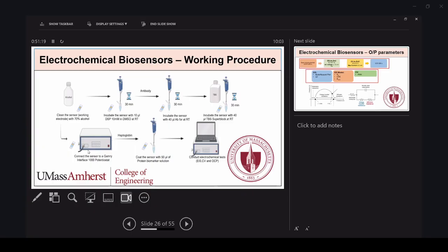And then in a series of different steps, we add this particular protein. We selected certain proteins. In this, I'm just going to give you an example of a protein which is responsible for breast cancer. And then we added that protein at different concentrations. We wanted to check the concentration dependent electrochemical sensor, right? Because at a higher level, there is a higher risk of cancer. At a lower level, it's a low risk, and normal.